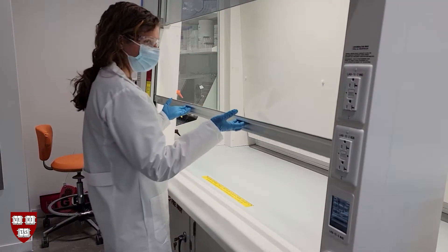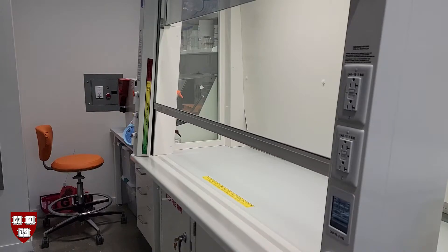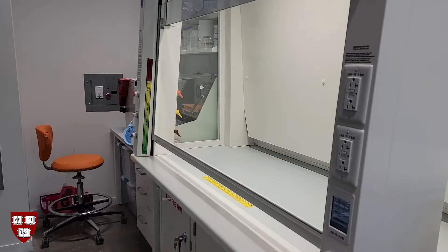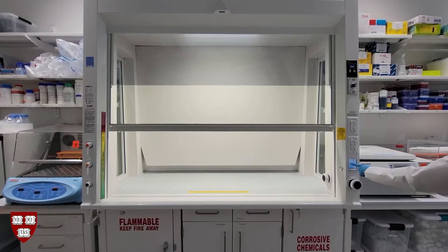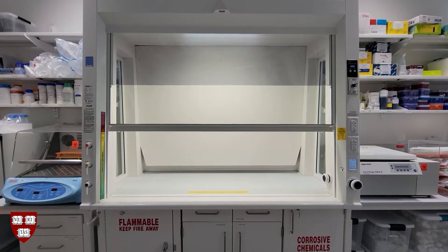You can also open the sash manually by using two hands to lift it up. There are a few ways to close the hood sash. Please note that when you walk away from the hood, the motion sensor will detect your absence and will close the sash automatically after a period of time.